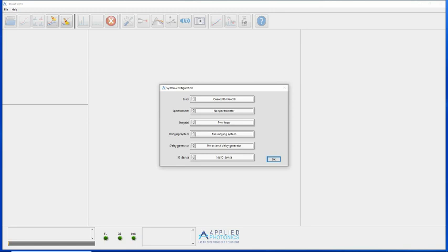It is also possible to acquire spectra using a laser that is not under the control of LIBSoft, provided that it is configured to trigger the spectrometers correctly. However, if a component is not connected, it is important that this is specified on the system configuration screen, otherwise LIBSoft will try and then fail to initialize it.